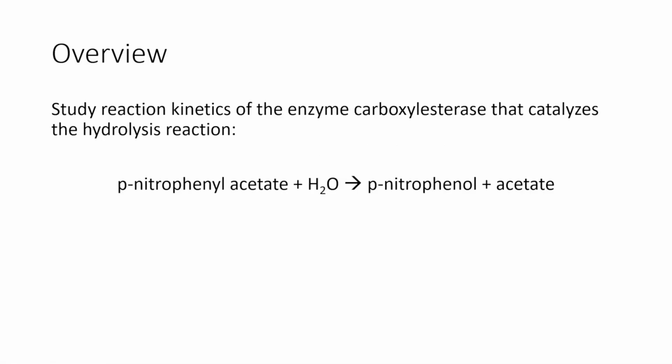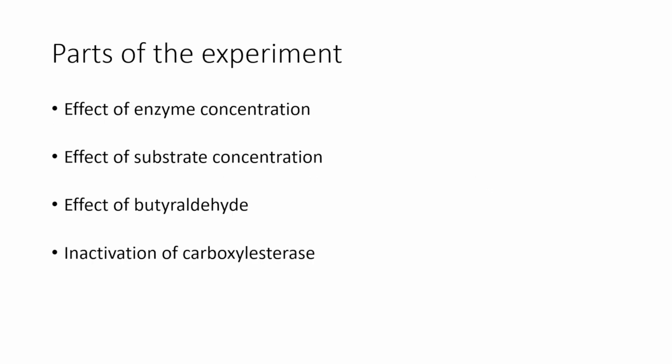All right, welcome to the pre-lab video for the kinetics lab. In this lab, we are going to study the reaction kinetics of the enzyme carboxyl esterase. This enzyme catalyzes a number of different reactions, but the reaction that we are going to examine during the lab is p-nitrophenyl acetate plus water. Water is being used for hydrolysis, and the products are p-nitrophenol and acetate.